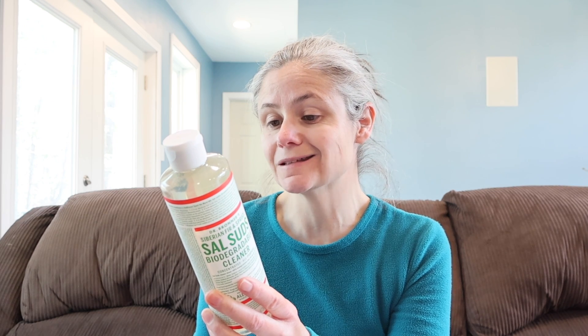Let's read how we're supposed to use Sal Suds. On the bottle itself, it says Dr. Bronner's Siberian Fir and Spruce Sal Suds Biodegradable Cleaner. I really can't wait to smell this — I love the scent of pine, Siberian fir, I love it. On the side, it has uses and dilutions. For an all-purpose household cleaning spray: one tablespoon per quart of water, spray and wipe with a damp cloth. Use to clean stone countertops, tiles, sinks, toilets, stainless steel, plastics, painted and sealed wood surfaces, and anything that can be washed. So I will make the all-purpose cleaning spray and use that during my test.